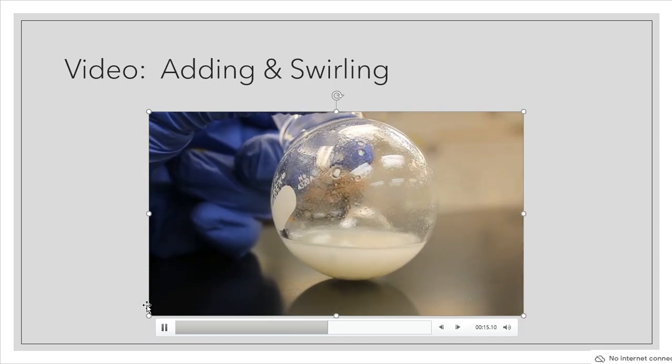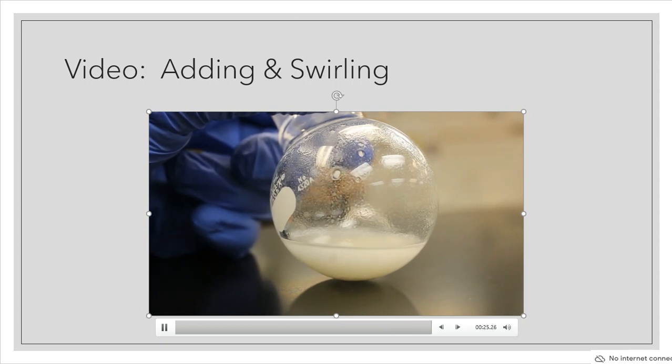So I'm getting ready to put this boiling flask onto my reflux apparatus, and I'm going to let it hang out with the slow addition of bromine. See, laboratory sciences can be very exciting, but maybe this isn't the best example for it.